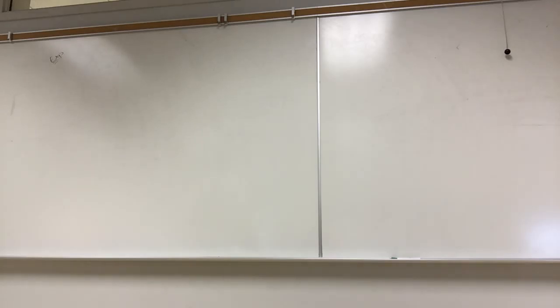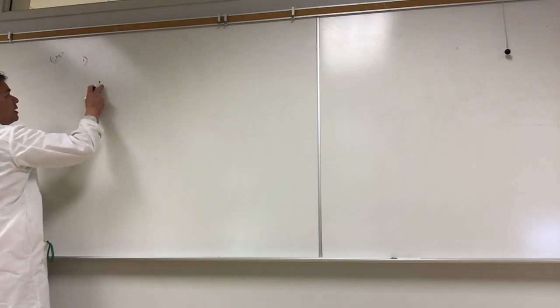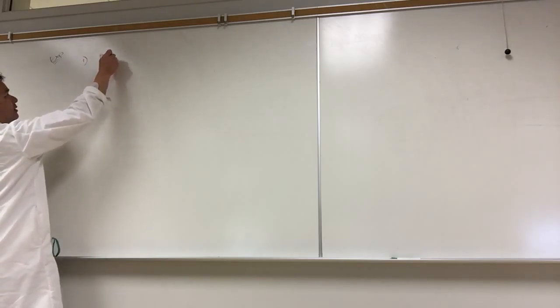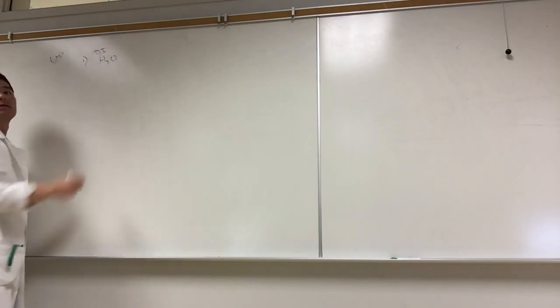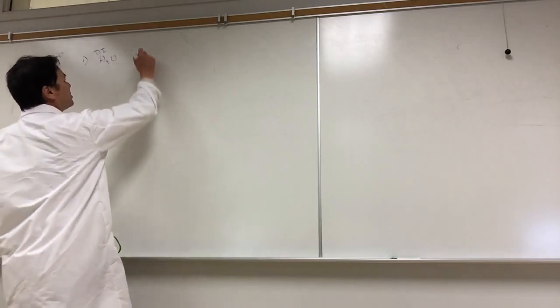So what do you need to determine the pH for? We're going to have sodium acetate. Actually, do we do water first? DI water? Or does that come later? Water's first? DI water? So we do DI water. What should the pH be? 7. pH should be 7, but our DI water is contaminated.